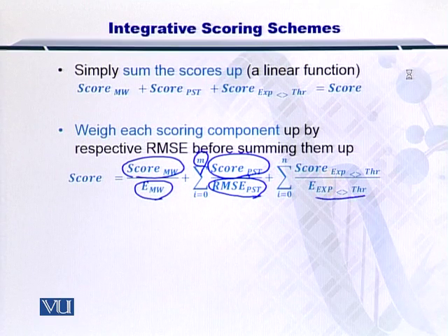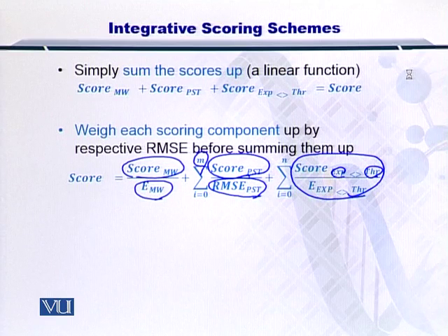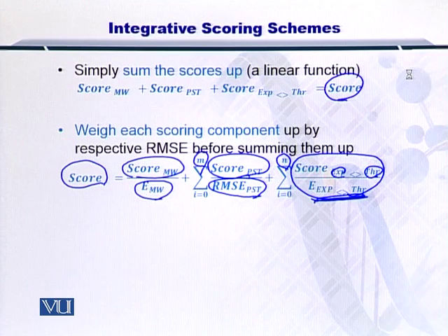Similarly, you compare the score from the experimental and theoretical spectral match, and you divide it by the overall error that was there during the matching. And you do it for the entire protein length. So by adding all of these three quantities up, you can have a better score as compared to the score that we obtained earlier. Of course, we can keep on optimizing this entire scoring strategy and arrive at something that is extremely depictive of the score of the protein.